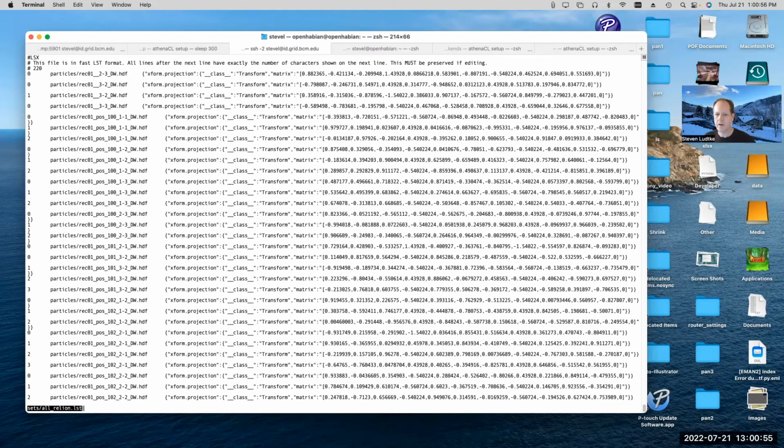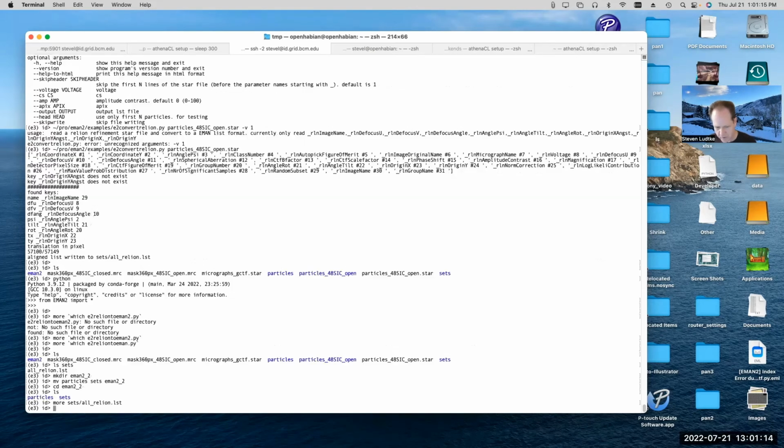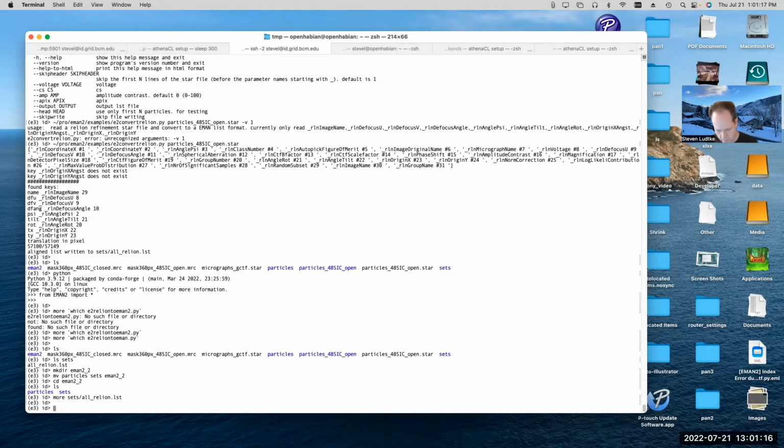Okay, so you can see that the LST file here, for each individual particle, has the transform information, the orientation information for each particle. The information about the defocus and that sort of thing would have been stored in the image headers.